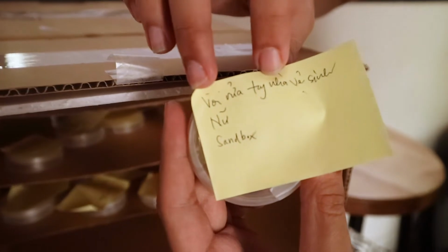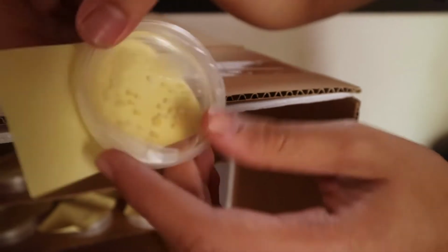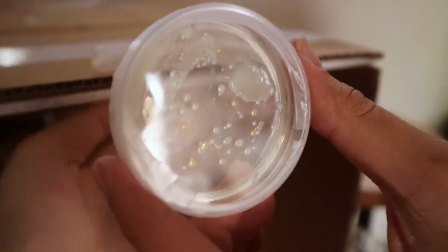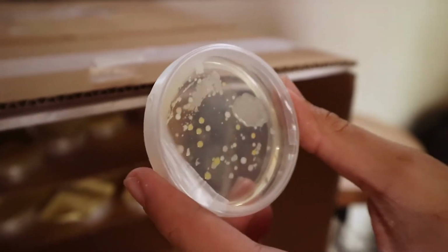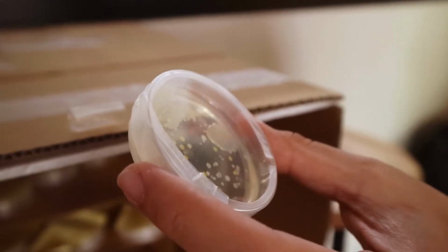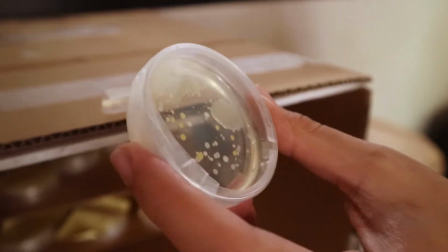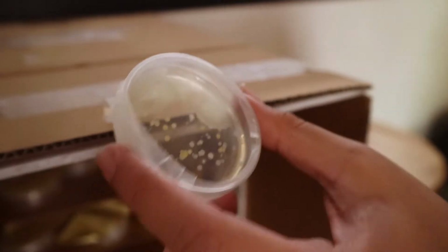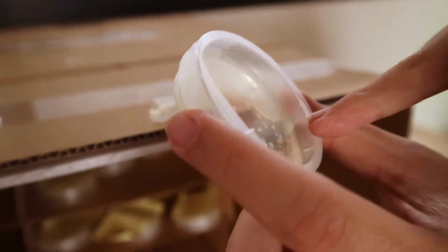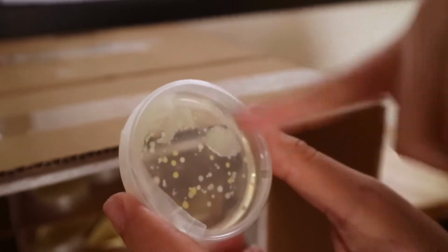The faucet in girls' bathroom. Sandbox. See? You see the colonies? The white spots are E. coli, and the yellow spot, I don't remember, but there are different shapes, different shades of yellow, I guess. There's light yellow, almost lemon yellow, and there's Fulbright yellow. You can see the one with the darker shades. So I guess there are more than 2 strains of bacteria in this petri dish.